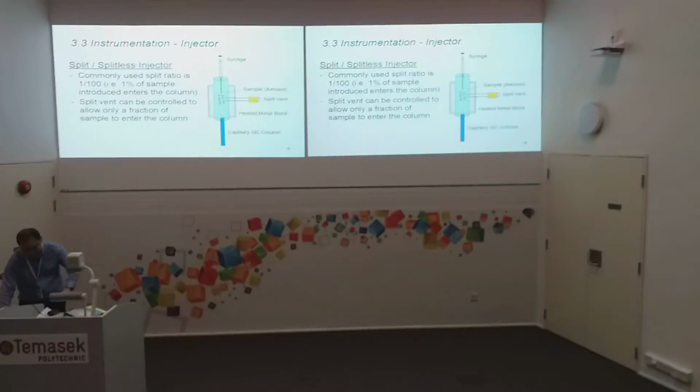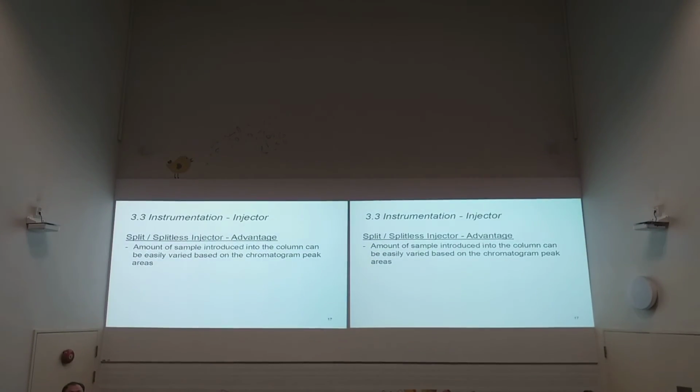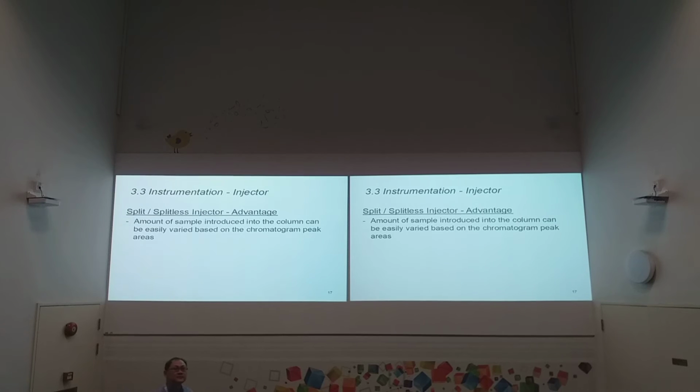After the split, it's just separated out. Oh, you mean that the part that goes into the environment? I understand. Can it be reused? No, not reused. All this has been taken into consideration. The instrument is designed in a way that the exhaust is handled properly.